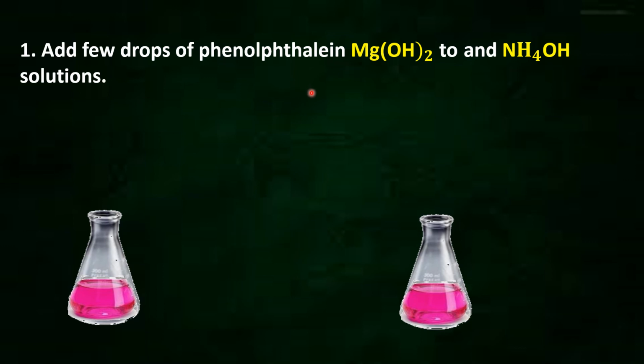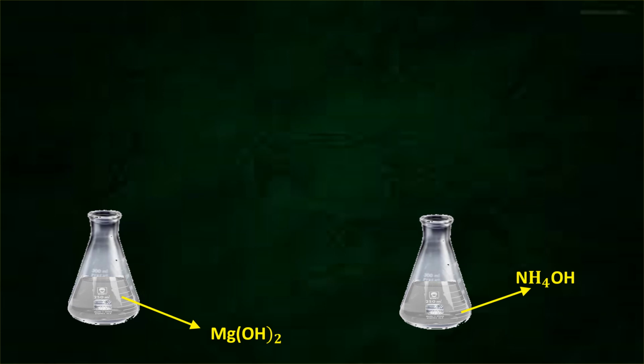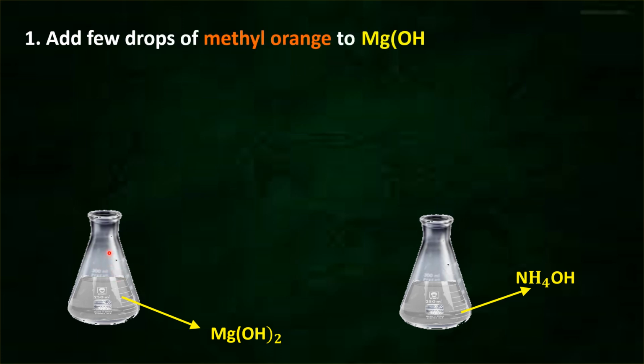Now we'll try with methyl orange indicator. Let us add a few drops of methyl orange indicator to both the solutions and observe what will happen.